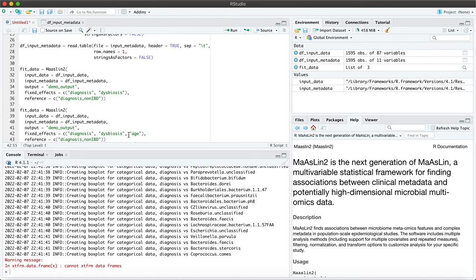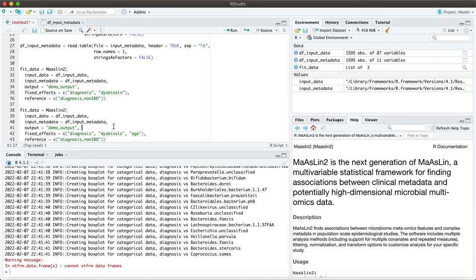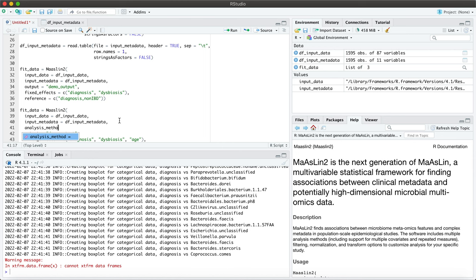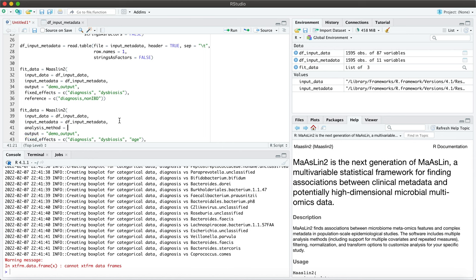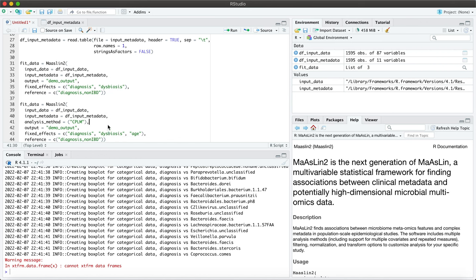So how this would look like, you can specify this as so. Make sure you include your comma or you will get an error.